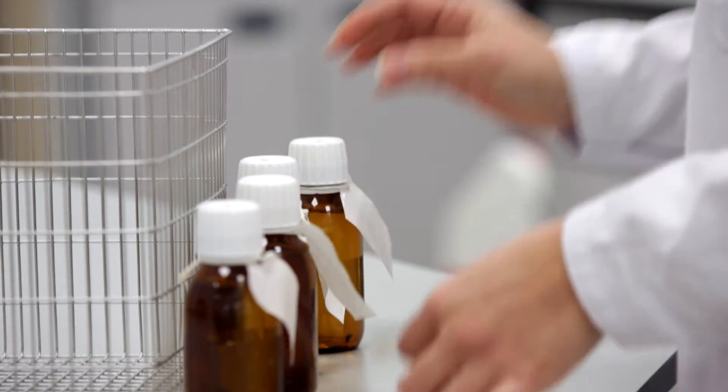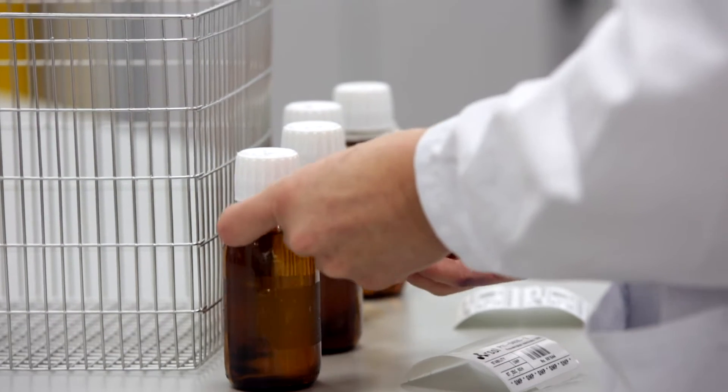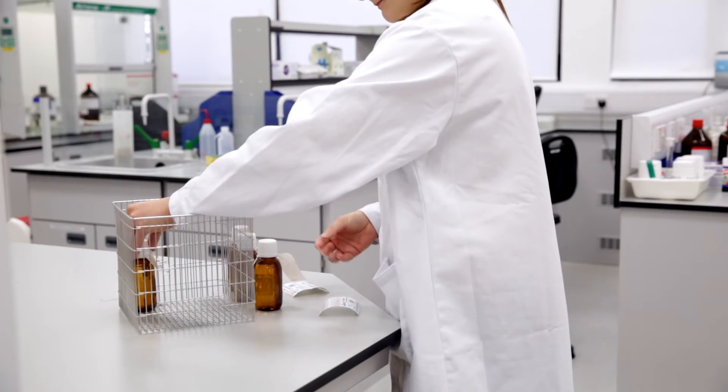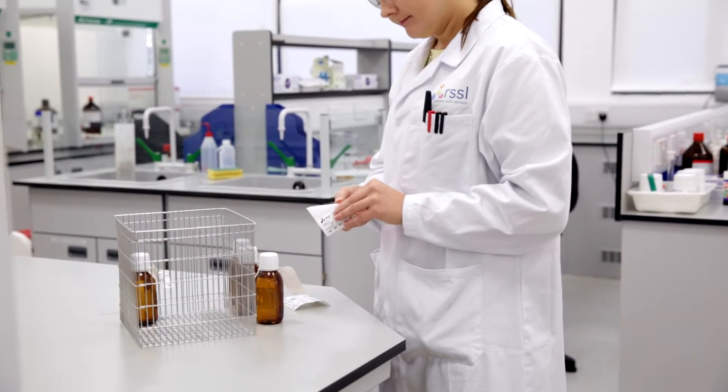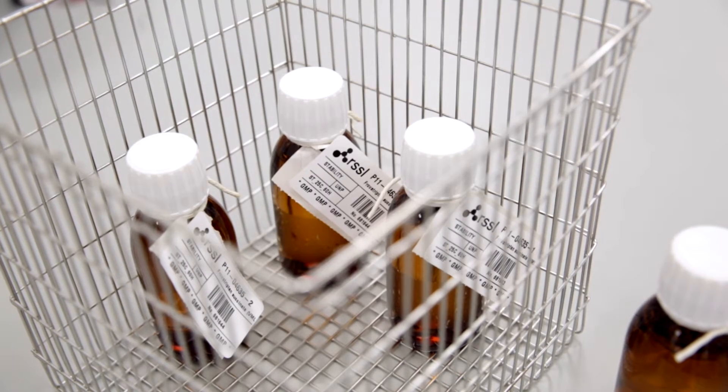To ensure integrity of analysis and results, the product in glass bottles with plastic caps is handled in such a way to limit any possibility of external factor interference. For example, the adhesive on the label may contain compounds that can leach into the drug product.